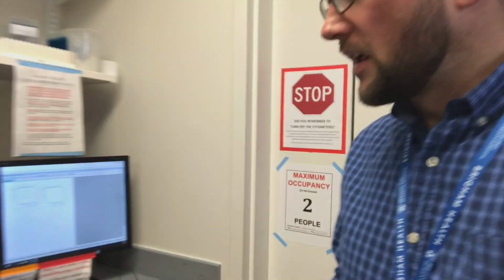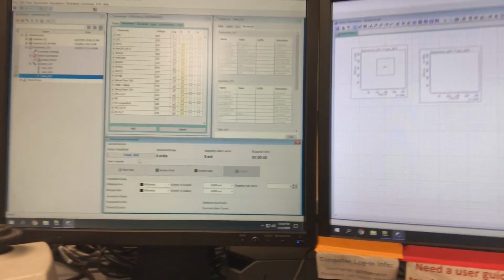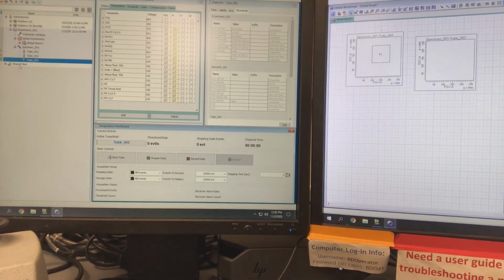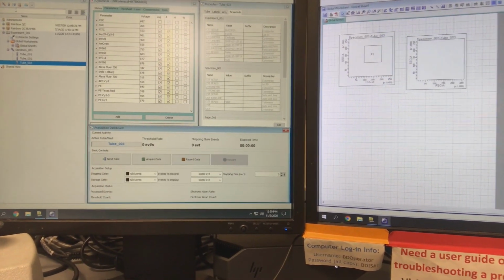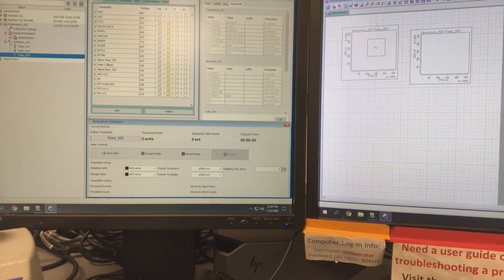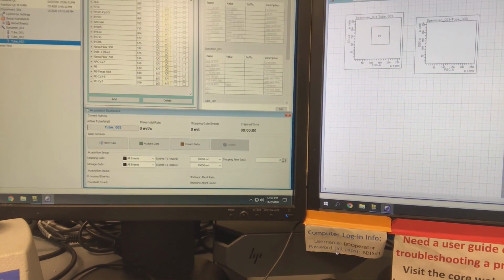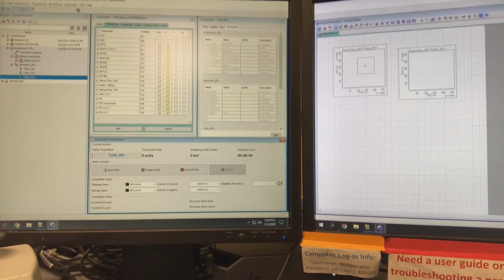So now that you've finished running your samples, you obviously want to get your data. Data management is a very important part of both the purpose of using these machines, but also in order to keep an efficient running core. So we have a policy that you're not allowed to keep any experiments that contain data within the BD software.